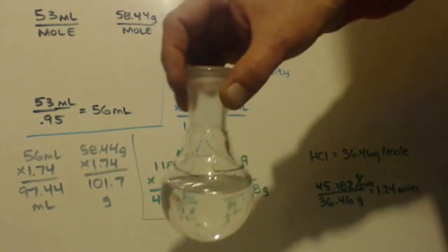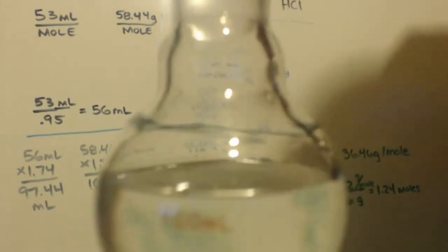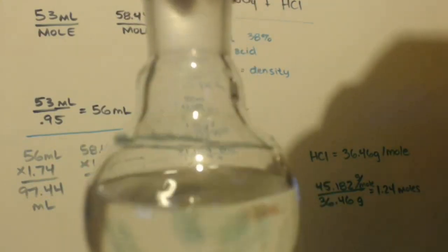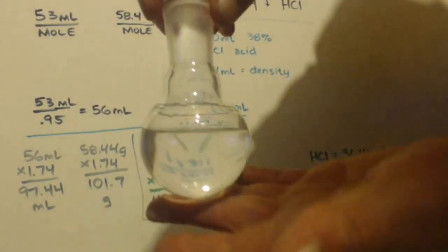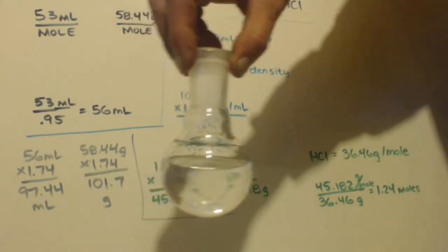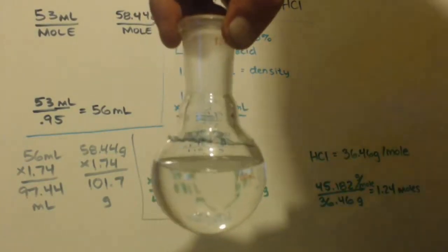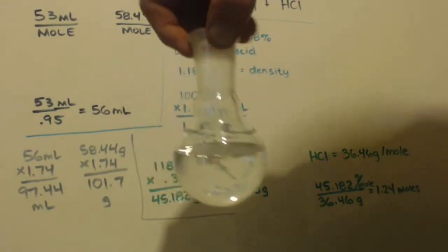So what I did was I put 100 milliliters in here, and I don't know if you can see it, but I put a line around there with a magic marker. It's not perfect, but it's an approximation. That way I know when I have enough HCl in there, it should be somewhere around that line, right? If I get it to that line, then that means this is 38%. If I get it below the line, that means it's almost 38%. We'll have to do a density check test.